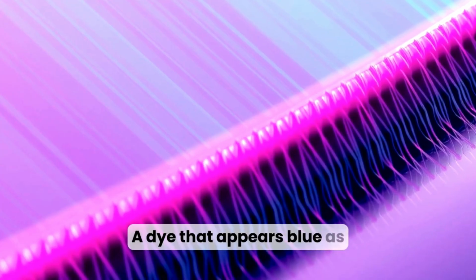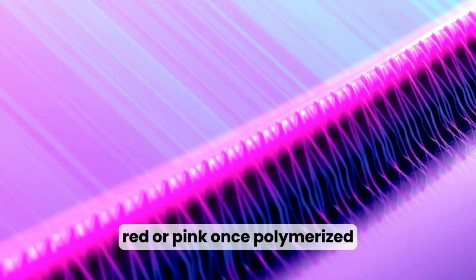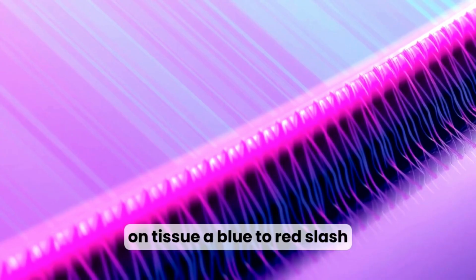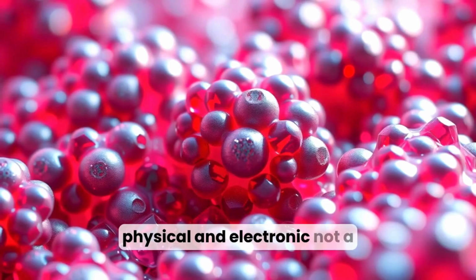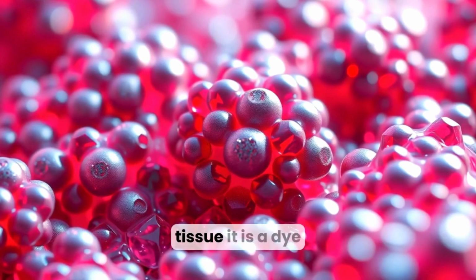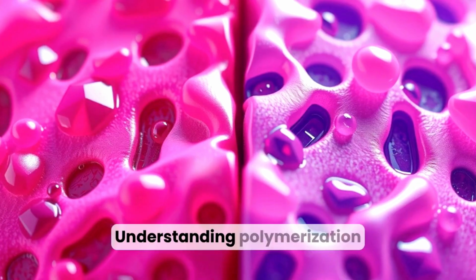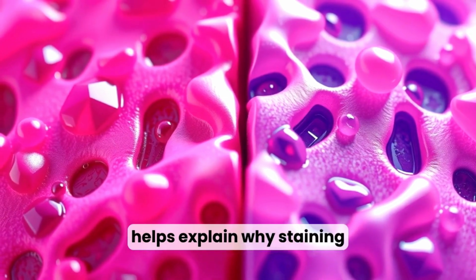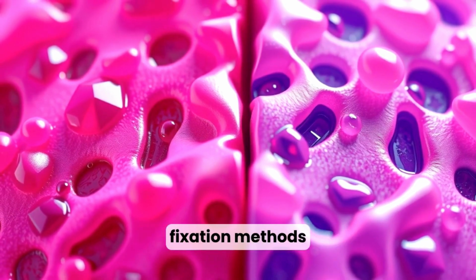A dye that appears blue as isolated molecules can appear red or pink once polymerized on tissue, a blue to red/pink shift. This polymerization is physical and electronic, not a new chemical produced by the tissue. It is a dye conformational and aggregate effect. Understanding polymerization helps explain why staining intensity and color can vary with tissue composition and fixation methods.